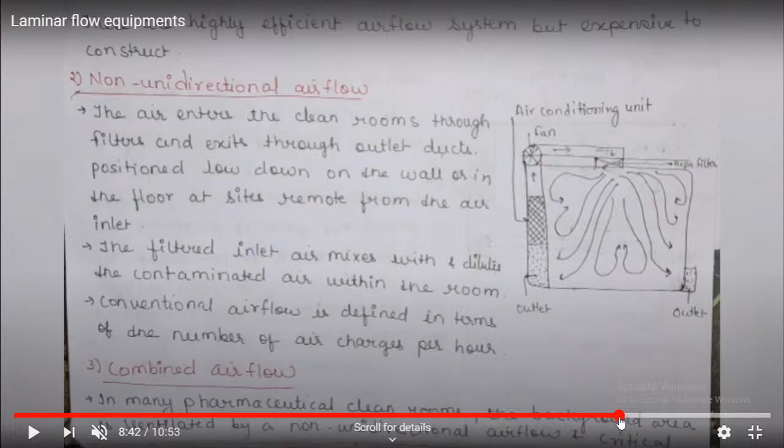The next one is non-unidirectional airflow. The air enters the clean room through the filter and exits through an outlet duct, which is positioned low down on the wall. The air at the inlet is mixed with and dilutes the contaminated air within the room. This conventional airflow is defined in terms of the number of air changes per hour.